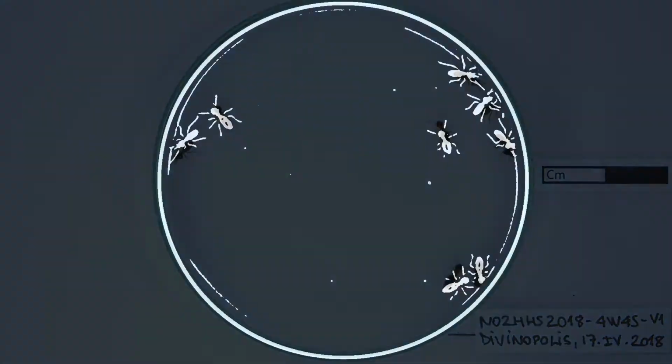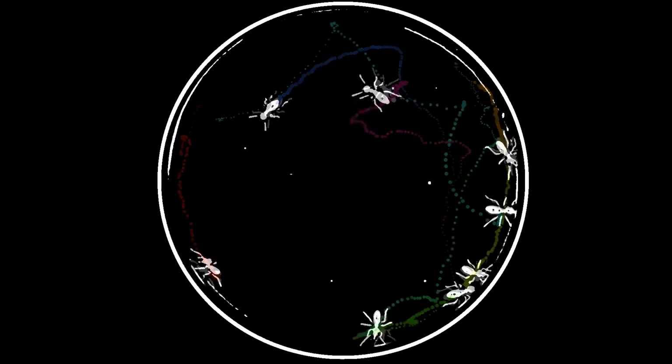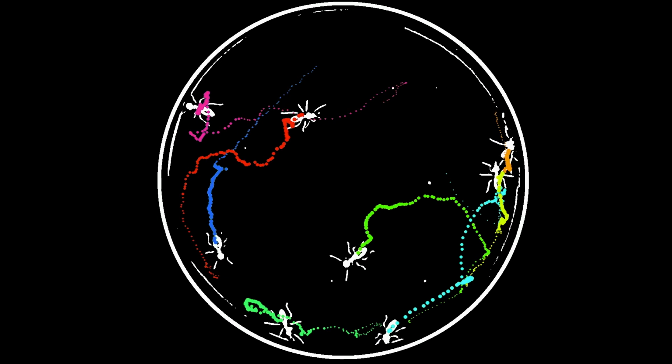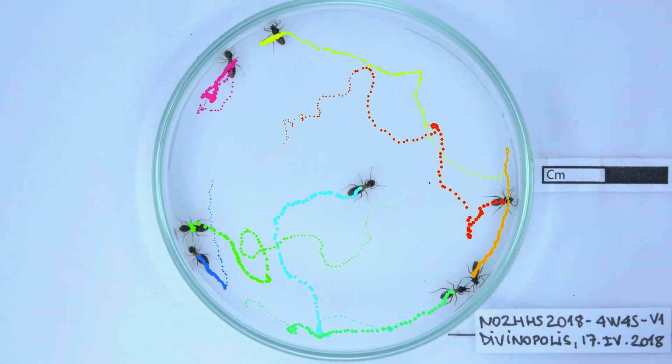The software works basically in a two-step process, the first step being detection and the second step being the tracking itself. The software uses a contrast difference between a background and a foreground to detect objects. The software uses a size threshold which you can manually specify, and it looks for animals that are within this minimum and maximum size limit. Any object that's bigger or smaller than this is removed.